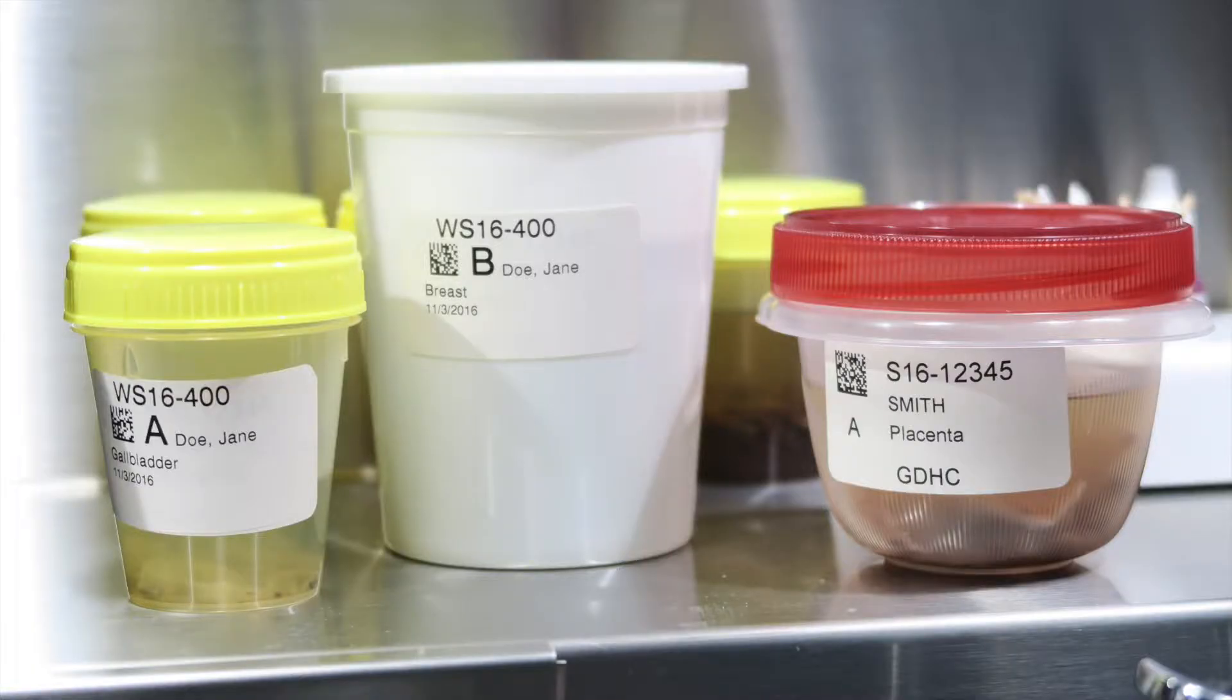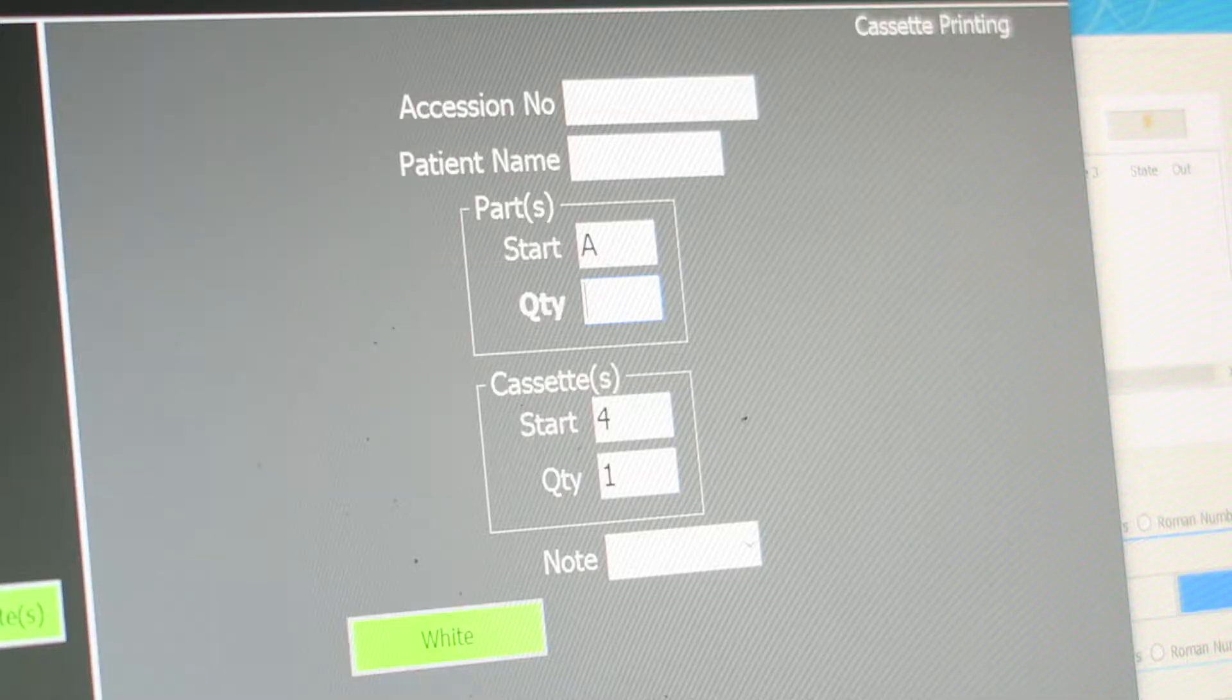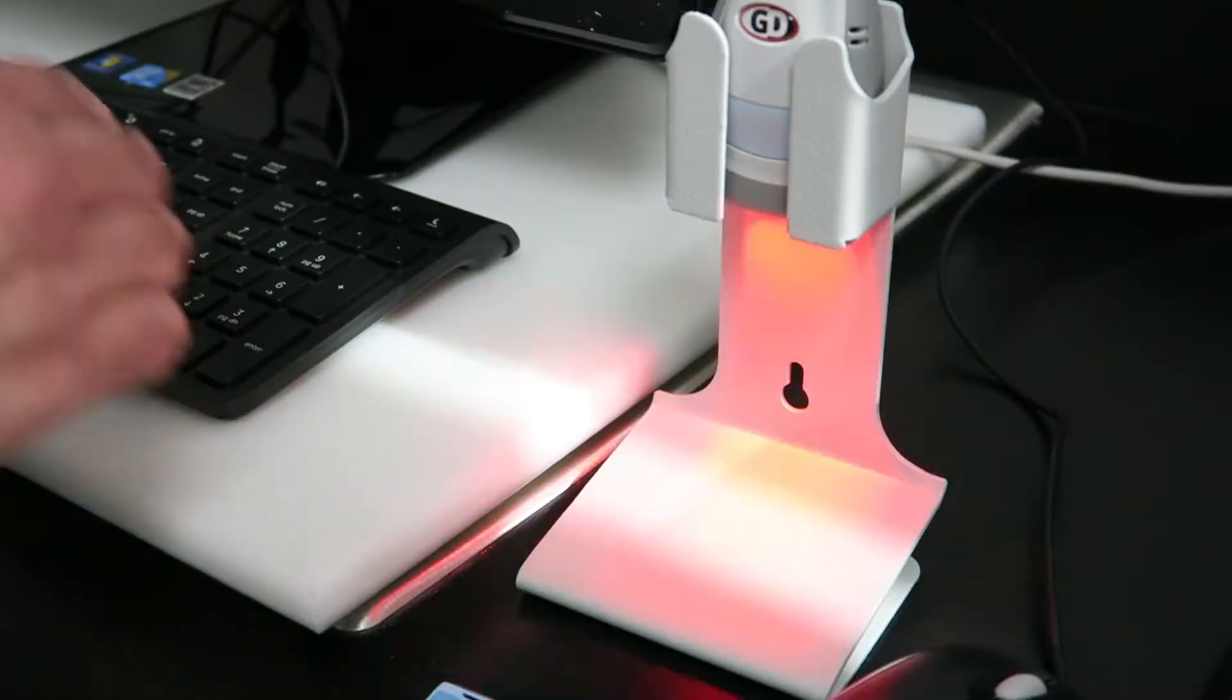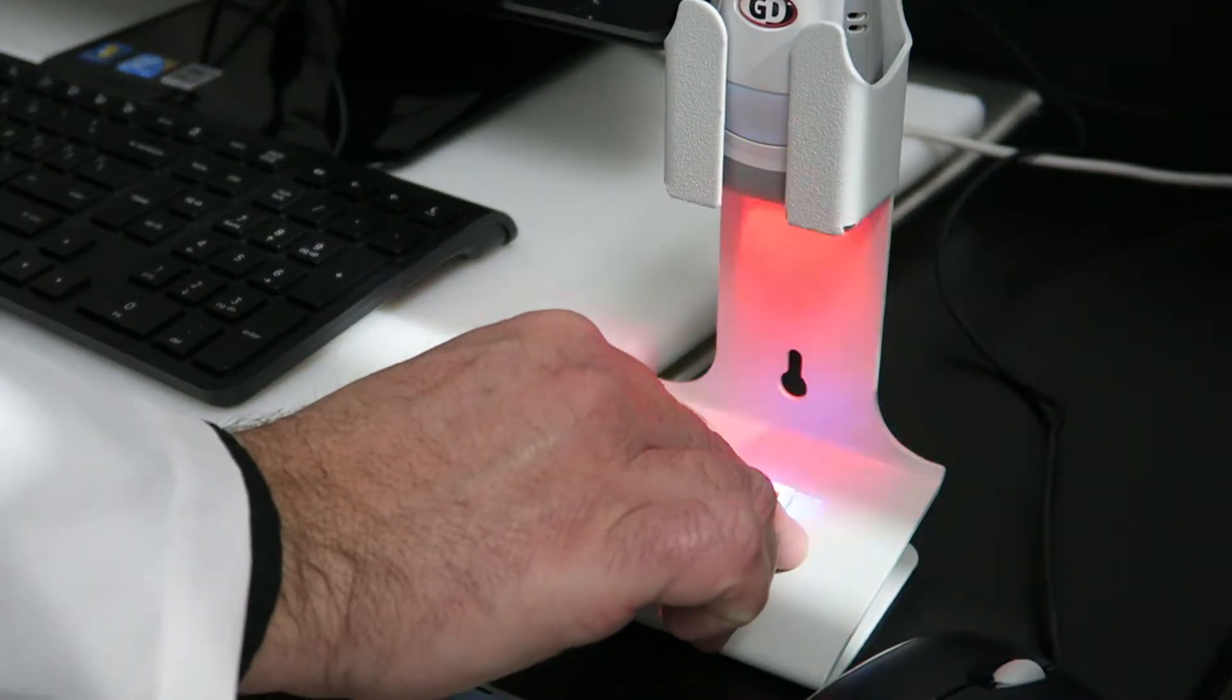Labs that use barcodes to identify and track tissue specimens can significantly increase productivity and eliminate errors. And if labs want to print barcodes on cassettes that will scan reliably and consistently, they must use laser printing technology.